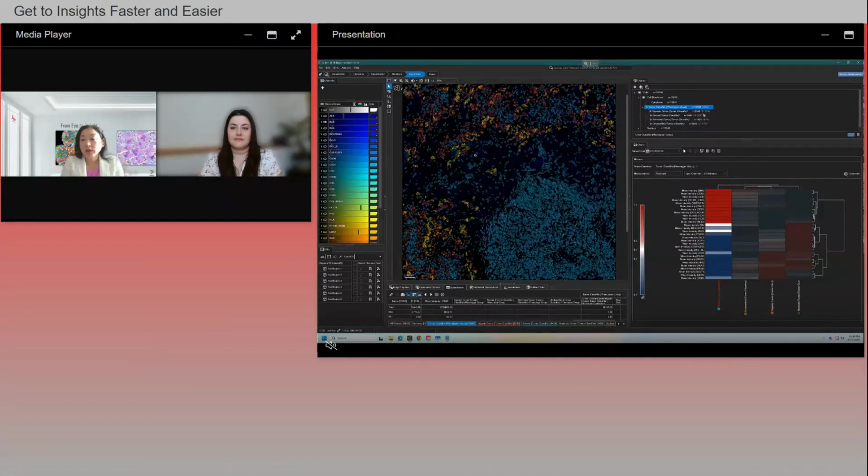Meaning when you have complex shaped objects, we try to go for the most accurate level of detection such that each cell can have distance information to another cell type or to its own self. And that can serve as the basis for dissociating the difference between cells that are close together versus cells that are far apart. And you can also visualize that in a distance-based heat map. That can be something of interest for you as well.